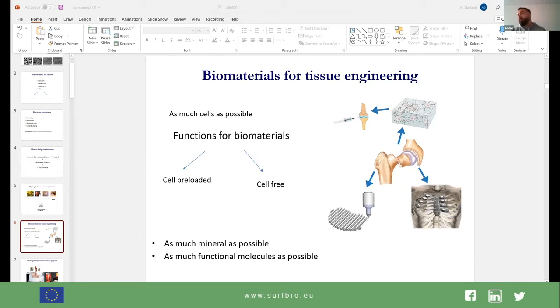This one idea is the key idea of bioprinting. Because if we mix our gels, for example, with cell spheroids, and start dropping them into the cross-link solution, we can drop any possible tissue and possible structure. After this, the spheroids can fuse and form the tissue.